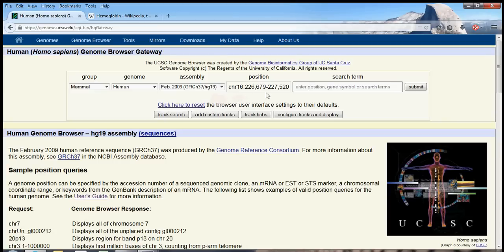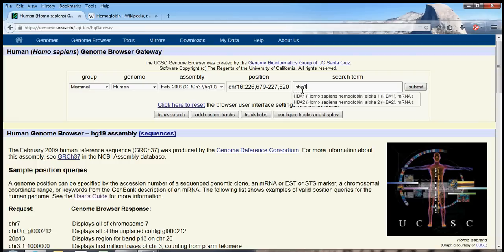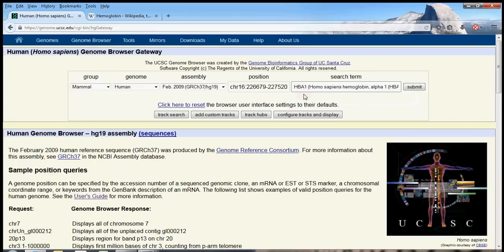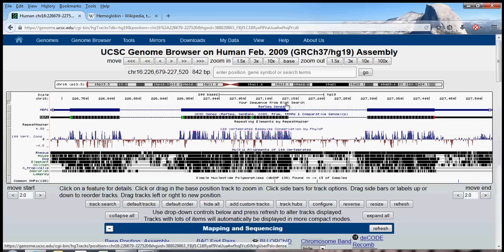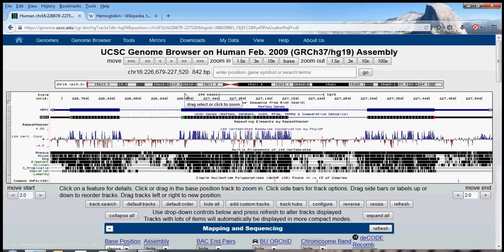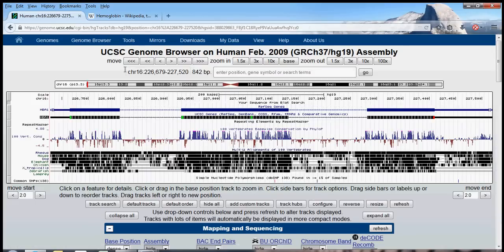And now we can go anywhere in the human genome that we want. How about a gene that we are probably all familiar with? HbA1 is one of the polypeptides contained in the hemoglobin protein. So I just click submit, and the genome browser brought us to the hemoglobin A1 gene.